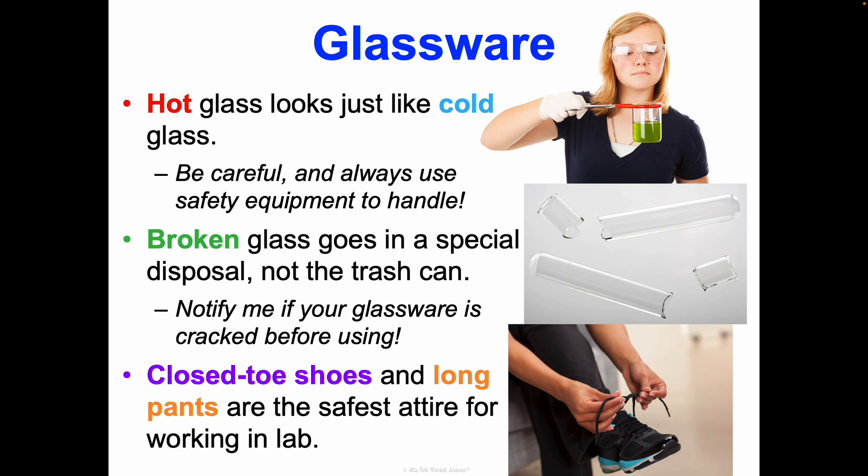It is always best to wear closed-toed shoes and long pants — that is the safest attire for working in lab because it protects you from anything dropping, anything sharp, glassware shattering, or exposing your skin to things it shouldn't be exposed to. Those are all the main things you really need to know. Now we're going to practice together looking at some things in our classroom — we'll do some stations, look at different scenarios, and explore lab equipment. What we learn in these stations is important, and we'll treat that as notes when reviewing for assessments.